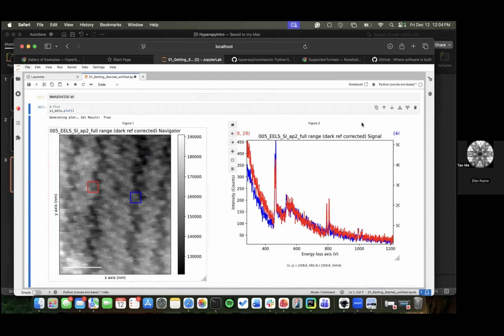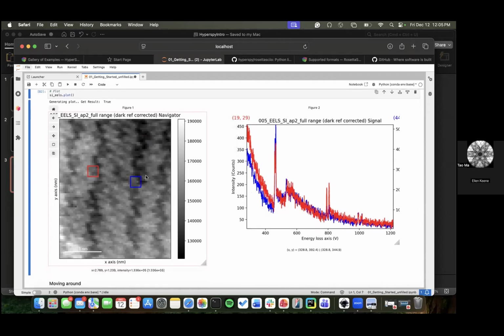Okay, so then he's talking about customizing the plot. In general, this is a good point to come back to; maybe we can talk a little more later in a different session about how to make really nice plots. Basically, these plots are really supposed to be just for visualization. Part of the problem is that adjusting these plots becomes a little tedious, because there's a lot of background stuff making these interactive, and so there are lots of additional components involved.